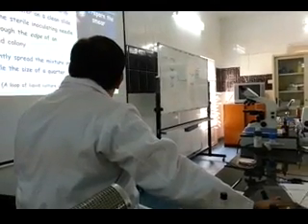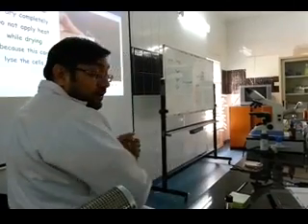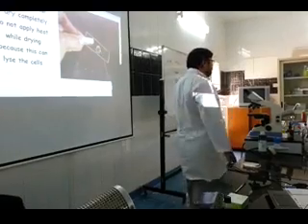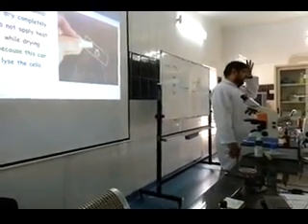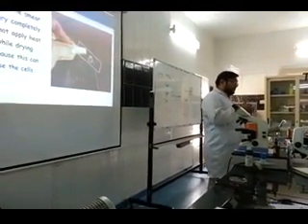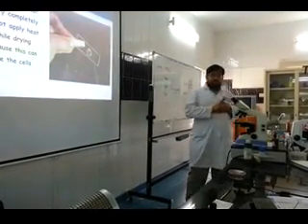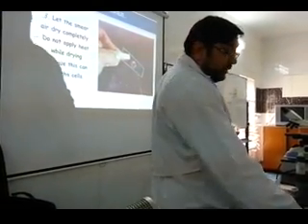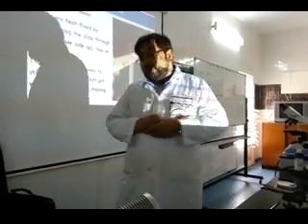Okay? Next you spread. Next thing, you air dry. Once you have got something on the slide, you just leave it for 2 minutes, 3 minutes. So it is dry. Okay? You air dry. Sterilize your loop, take one drop of distilled water, mix, air dry. For solid culture. Okay? So when it is dry, next thing, heat fixing. What is heat fixing?